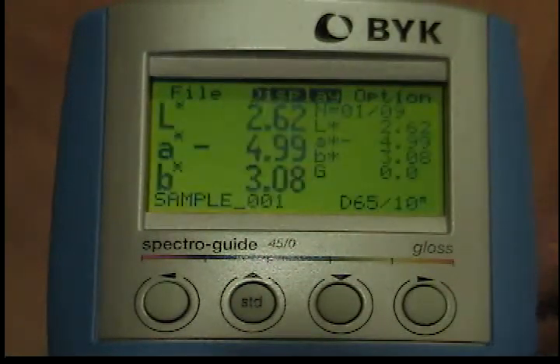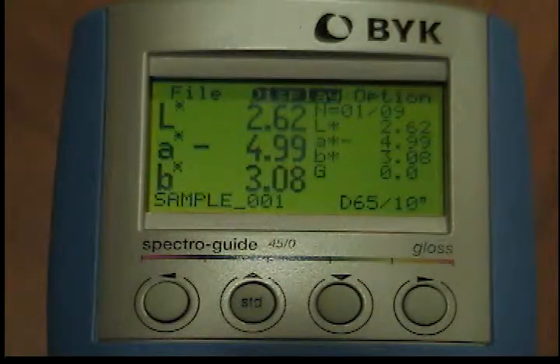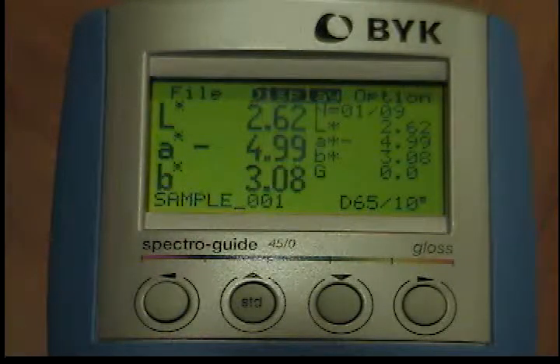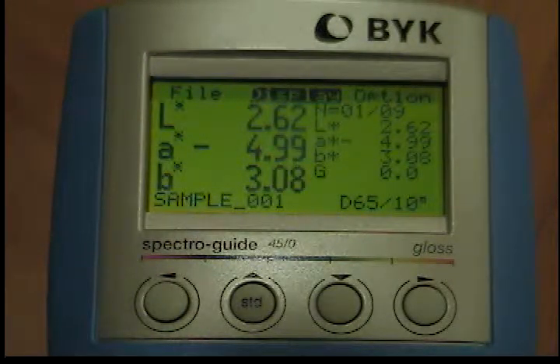The absolute values from the last reading will be displayed in a large format in accordance with the chosen color system. The type of illumination will be displayed at the lower right.